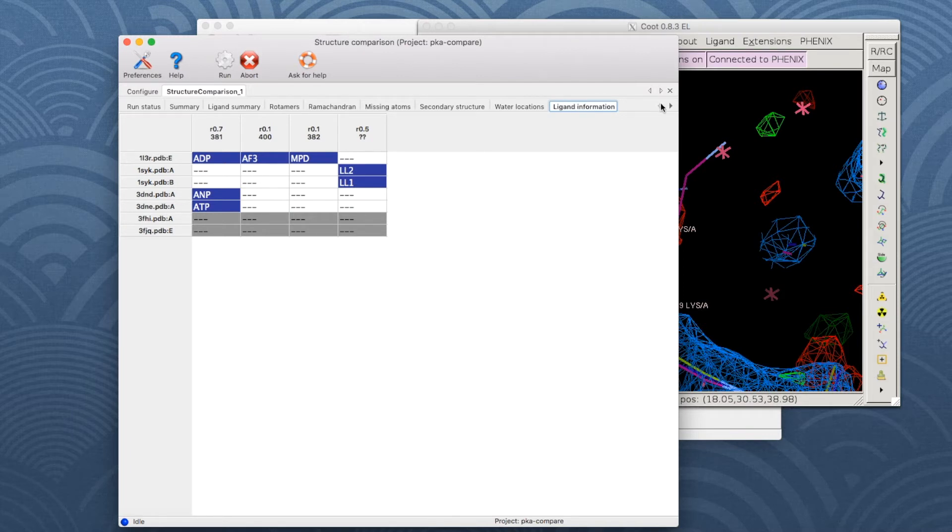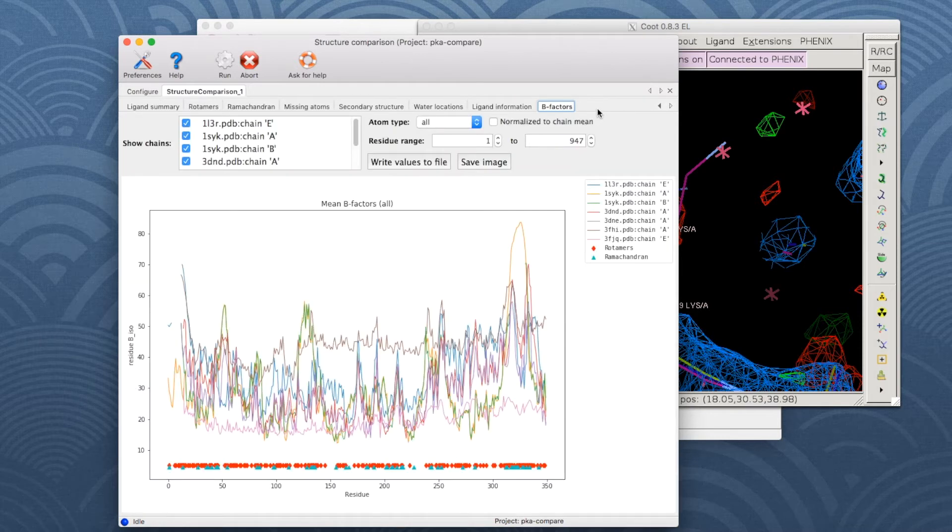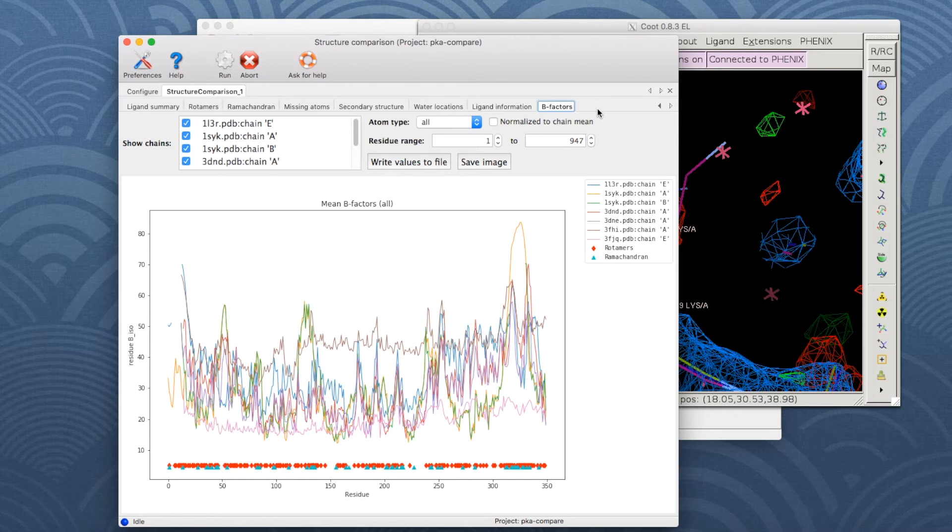The B-factor tab shows the per-residue average isotropic B-factor. It can be used to identify regions with higher B-factor, which can represent larger mobility or reflect modeling errors.